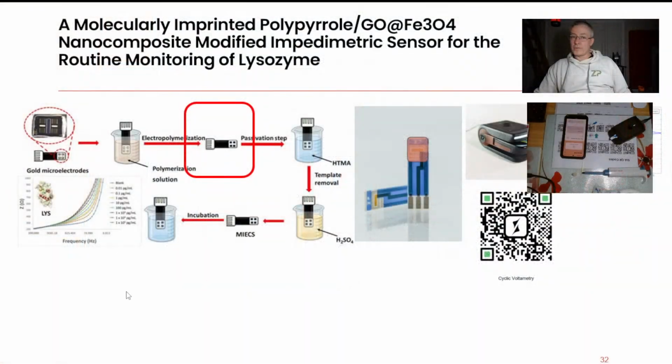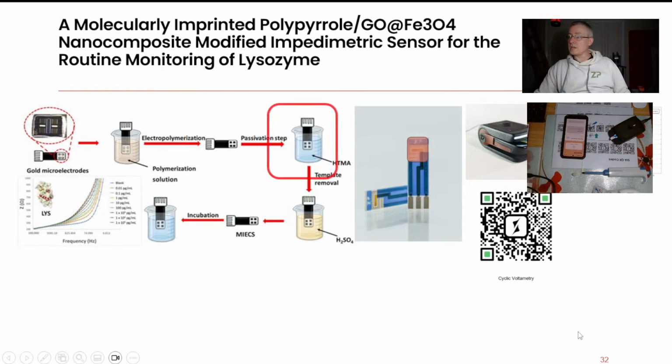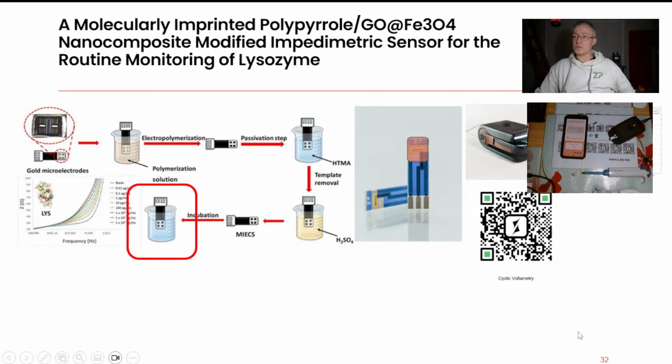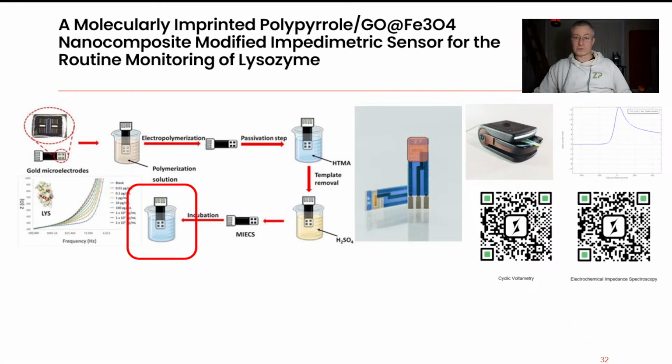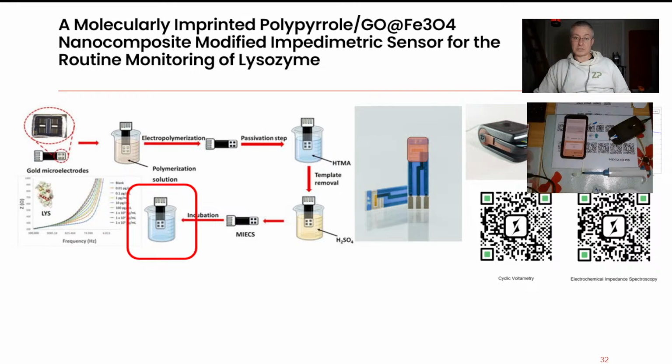Right, so the process in the paper is quite easy to translate onto one of our gold electrodes. I've read this, and this is all fairly straightforward. And at the end of it, they use EIS, impedance spectroscopy, so we can both functionalize the electrodes on the Sensi-All potentiostat, but also do analysis on the Sensi-All potentiostat as well.